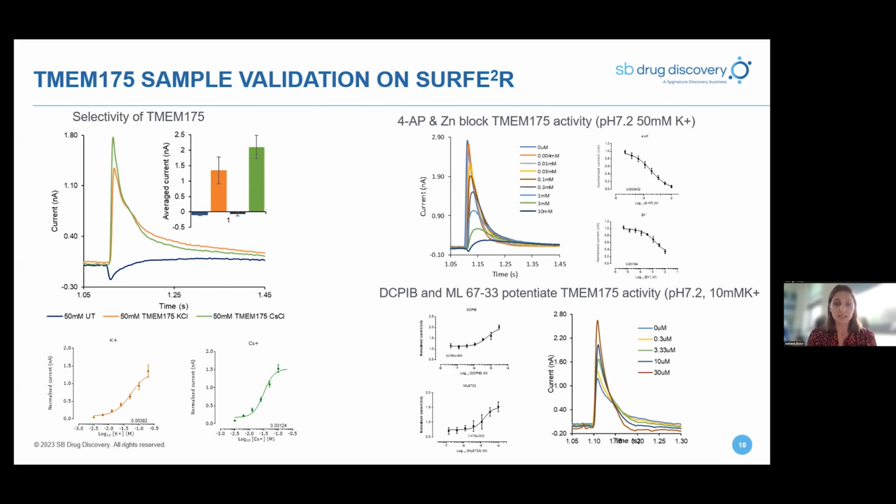And we also chose another activator, ML6733, which is a known activator for K2P potassium channels. And while the CRC is looking pretty convincing, it is in a 2-digit micromolar range here, about 15 micromolar, but it doesn't fall far from the EC50 values for K2P transporters as well, which range between 20 to 30 micromolar EC50 value.